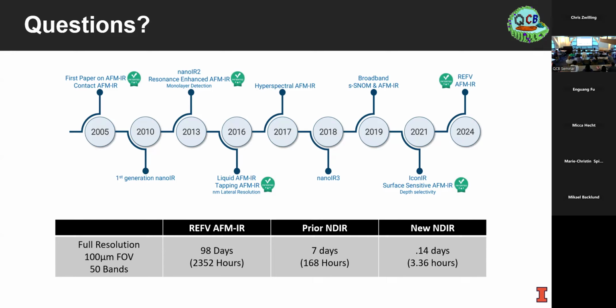Like I said, we're doing a third region of this project where we're trying to isolate surface measurements so that we can go thicker and not have to worry about the resolutions. But these fields extend deeper, so if you just isolate it thinner, you get.